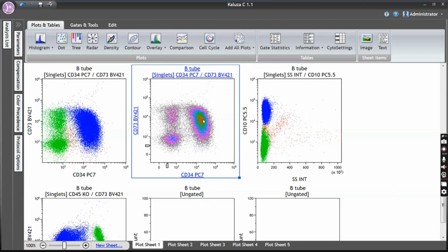Now this will tell you in which place the cells are more dense. Okay. Normally, if you see the weather report or something, they use the contour or the density plots. See, this is highly concentrated. The events are very concentrated in this area, and slowly the density decreases. Okay. So this particular plot will be very useful when you are gating, selecting a region of population, because it will give you a clear boundary.